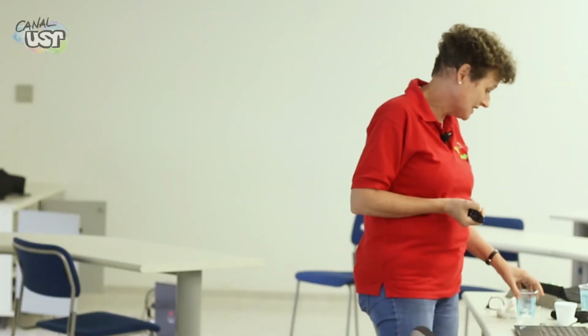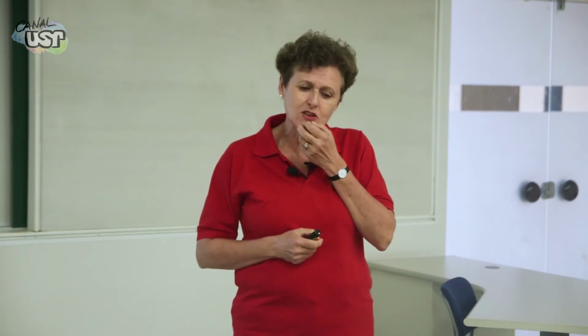I had a very good example where I was completely fooled myself. Somebody had given me these ancient samples, coming from Roman concrete. We had this new polishing machine in the lab, and I put it in the electron microscope, and there was this lead everywhere.